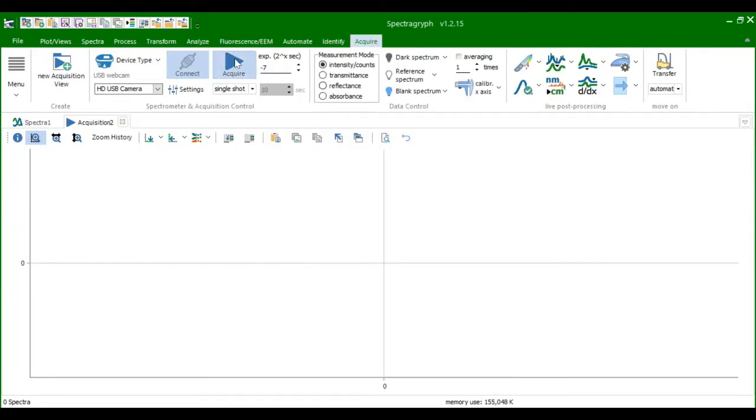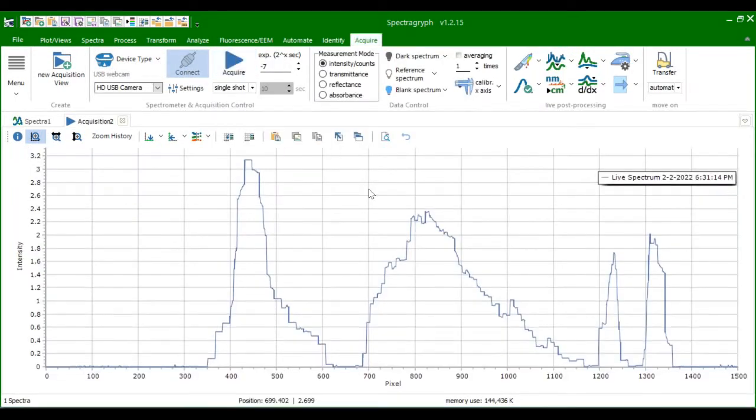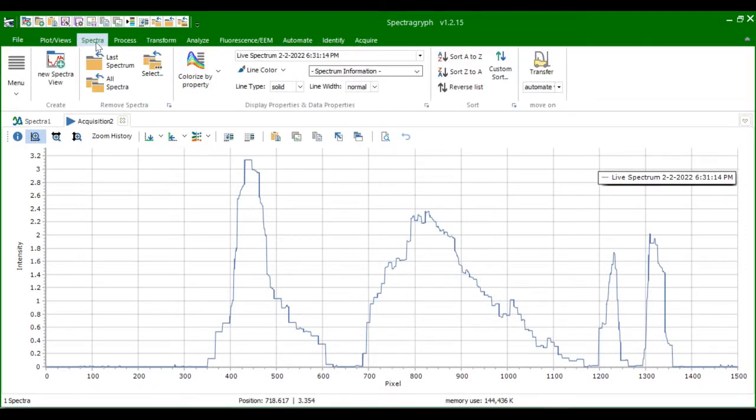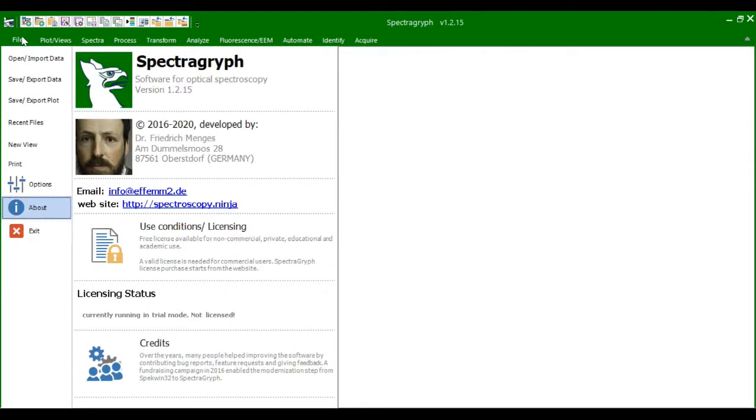Instead, by using the Spectragryph software shown here, you can not only capture the spectra data, but then quantify and analyze it using a bunch of useful tools. This was all built by Dr. Friedrich Menges, and the basic software is free to use for individuals.